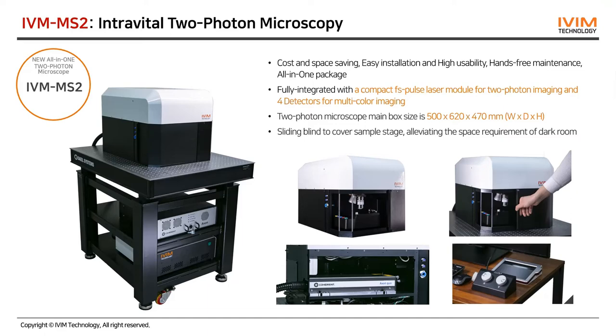So then what is, I guess, the capacity? You can have at least 4 confocal channels and a 2 photon. Can you go up to 6 lasers? If somebody had a rainbow mouse and wants to look at YFP and CFP, is it possible to put in 6 lasers?